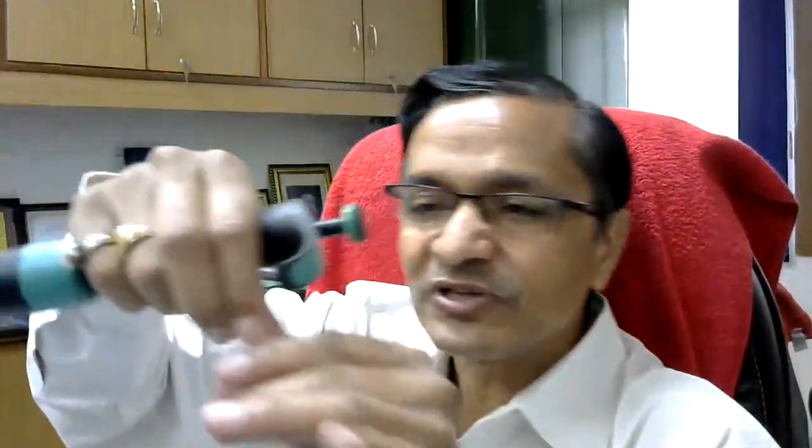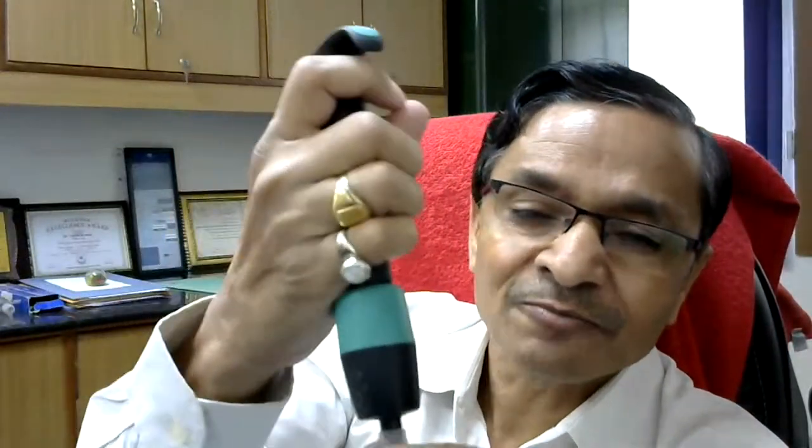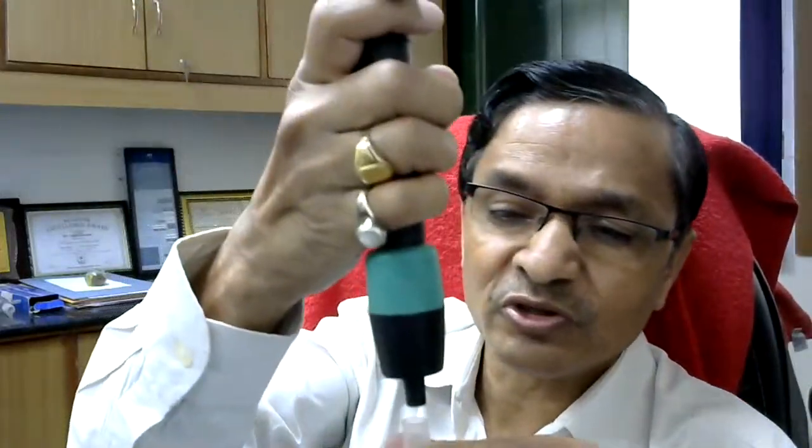We require bigger tips, and then you can easily take 5 ml. Again, this can be put in the tip box. You put it like this and then tighten it. Tightening is necessary, otherwise there will be leakage and proper sucking will not happen.